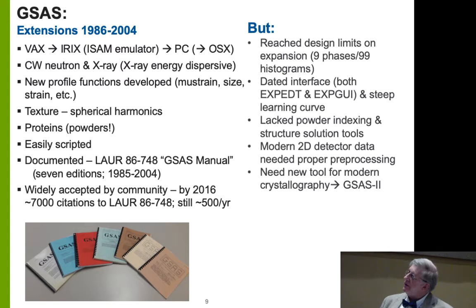And it also included, during this time, well, I added constant wavelength neutrons and X-ray analysis to it, and profile functions were being developed by people in the community. And so as these were developed, I implemented them in the code so then they would be available to me and also available to anybody else who wanted to use them. And so that's the main thing that went on, one of the main things that went on.